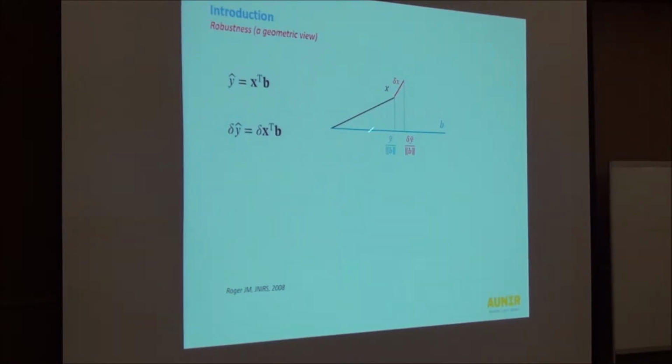Suppose you have some perturbation on your spectral measurement, let's say temperature perturbation or whatever. That can be shown here as delta X. Some amount of perturbation. And that delta X will lead to a delta Y, an error on the actual prediction. So what can we do to reduce that error? Any suggestions? One way is to reduce delta X. So controlled set of experiment. If you can control your experimentation, let's say temperature control, you can reduce that delta X for temperature. So control experimentation is always a solution, but that is not always possible.